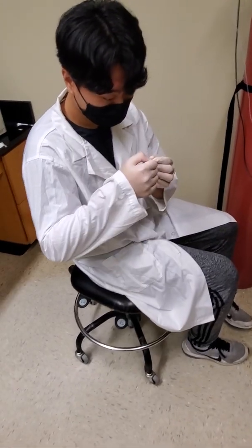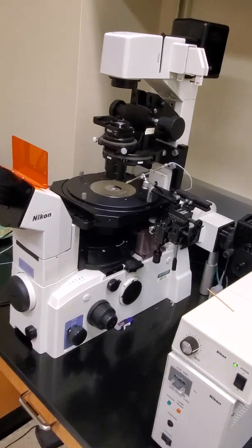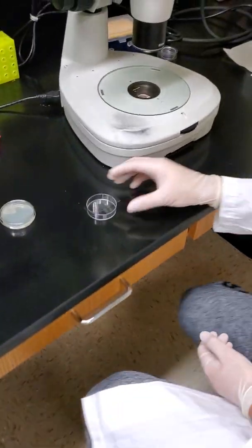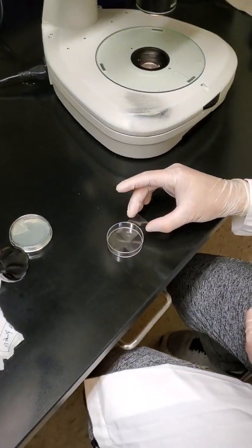And so after we're done flinging the needle, we're going to center it under the light in the microscope just to get it ready for the injection. Okay, so in order to focus the microscope on the needle, we're going to prepare our agarose slide.